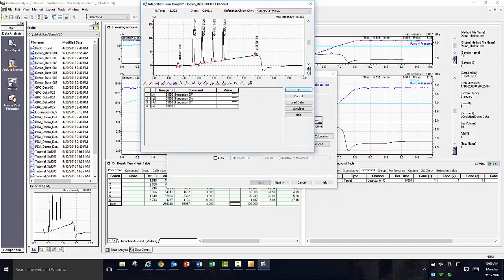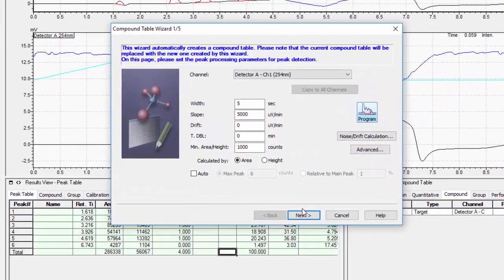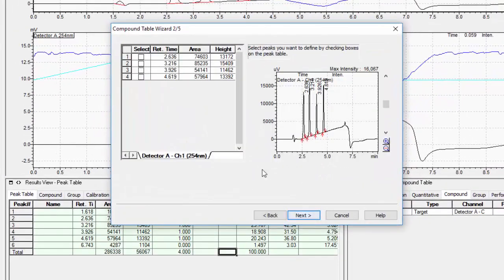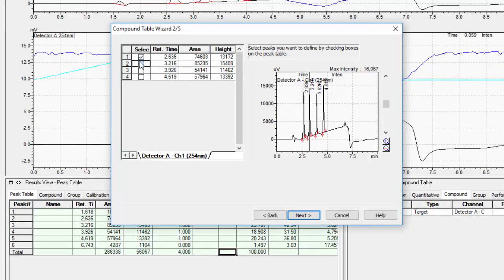Once you click next, you will be shown the peak table that has been generated based on your criteria. You will need to select from the list what peaks of interest you would like to be entered into the compound table. Please note that when you check the box, the peak is highlighted on the chromatogram with a vertical line to provide you with confirmation on your selection.